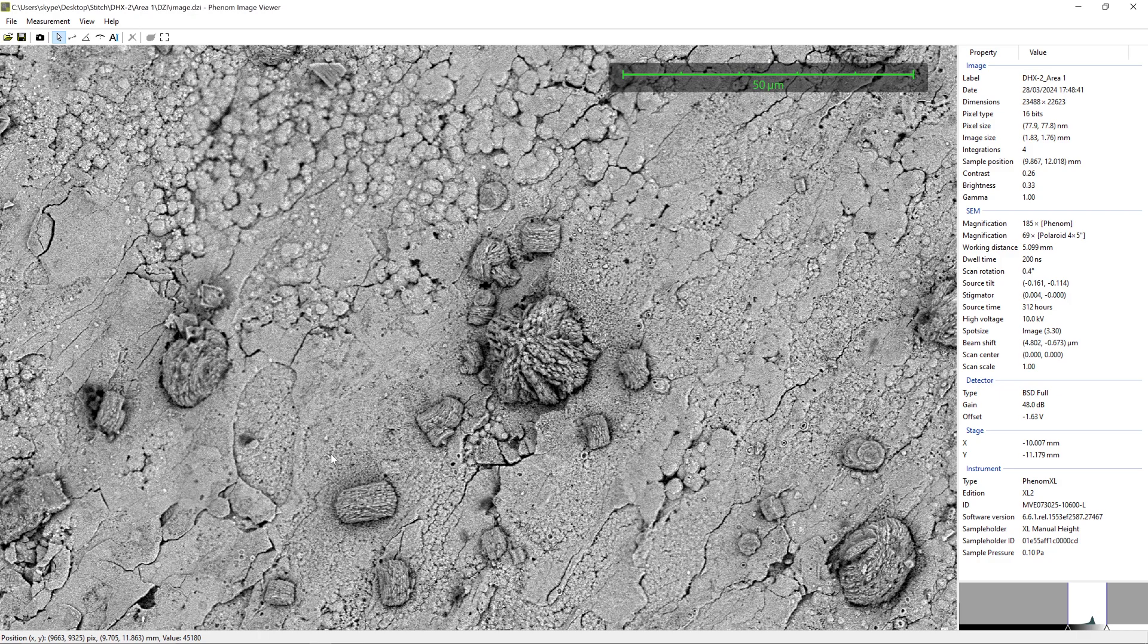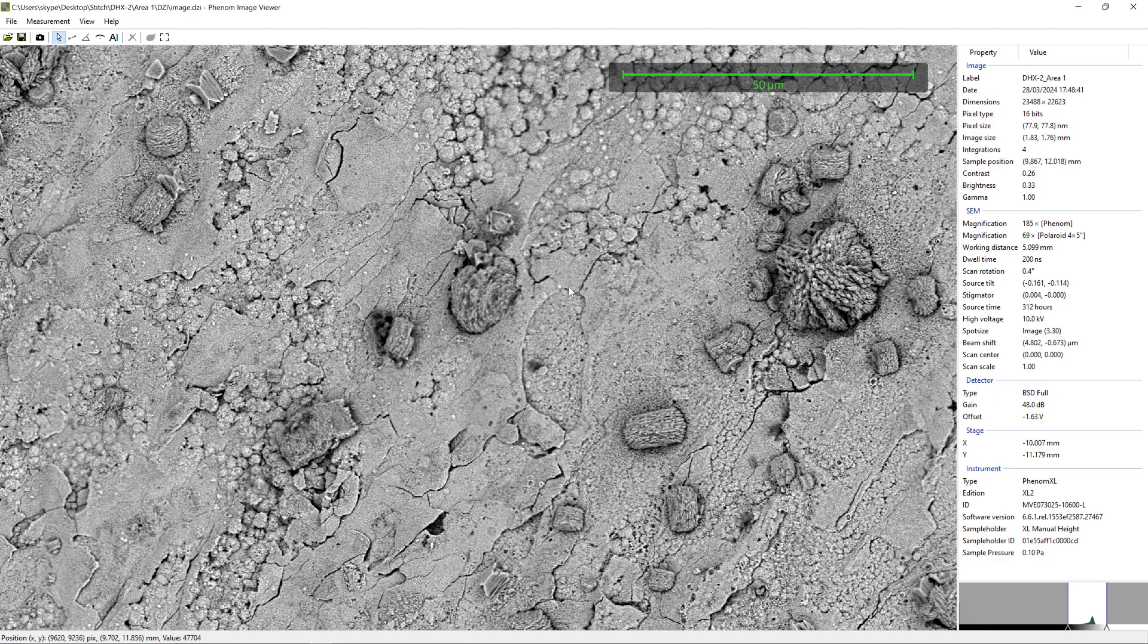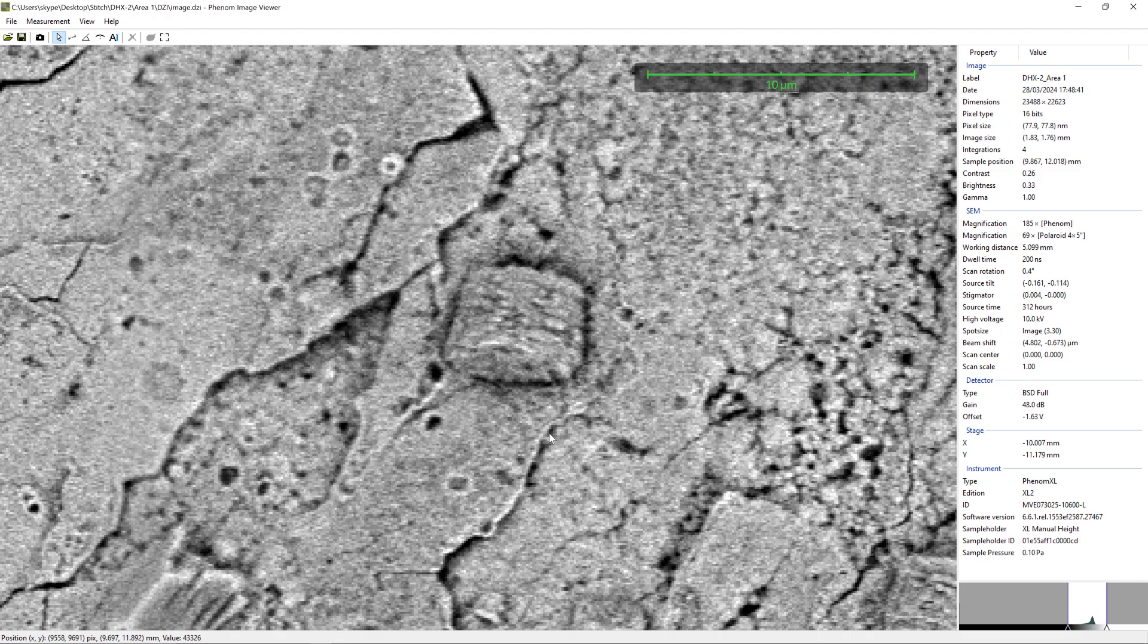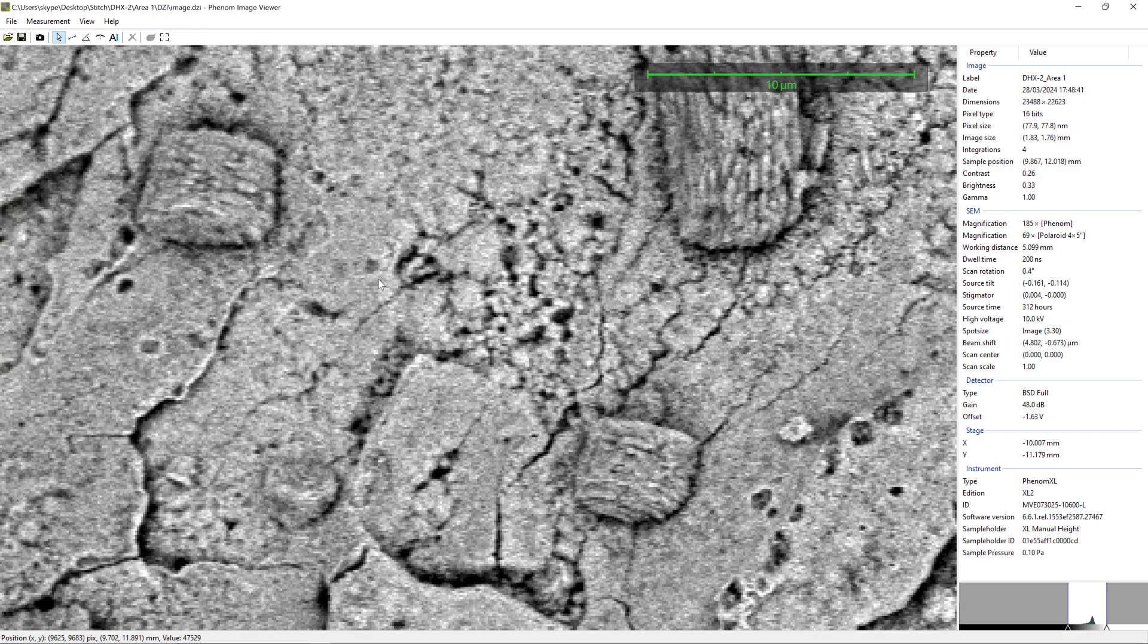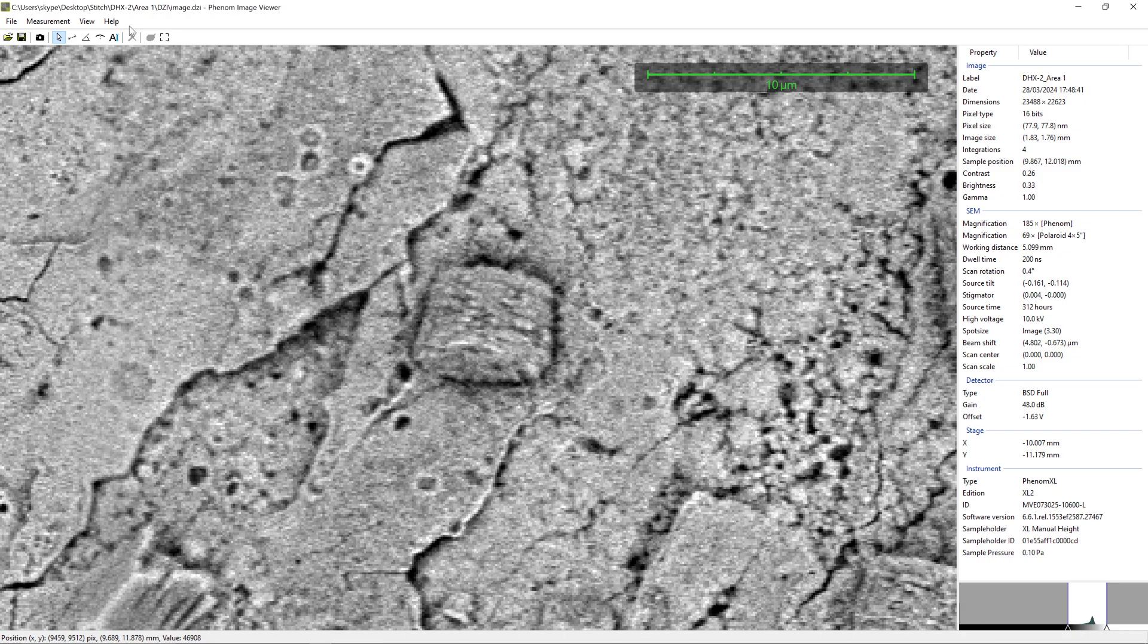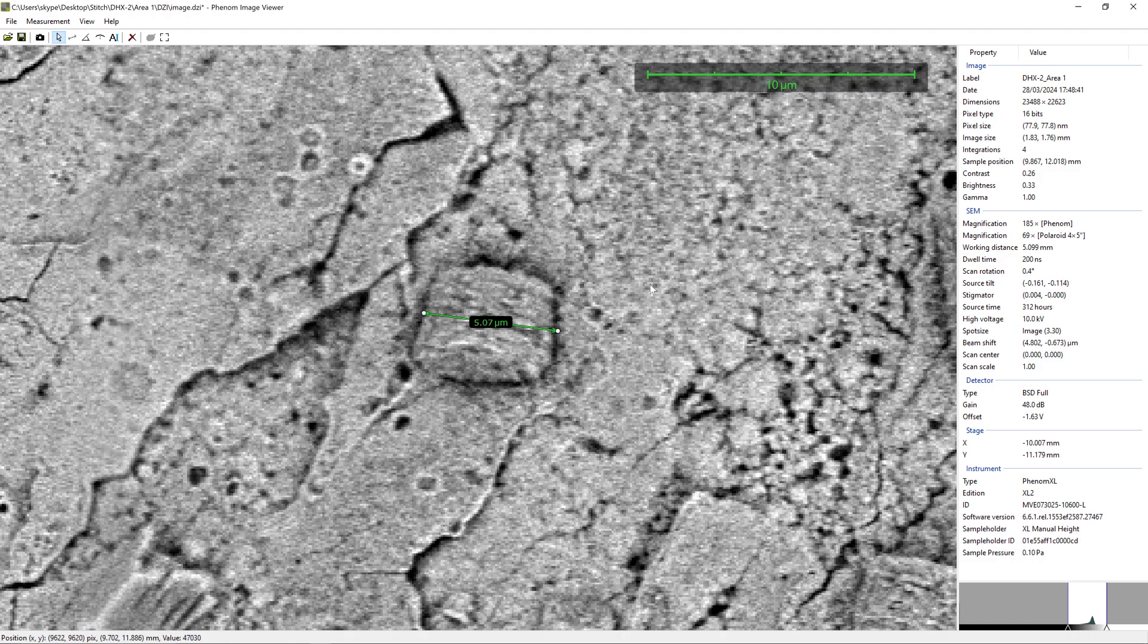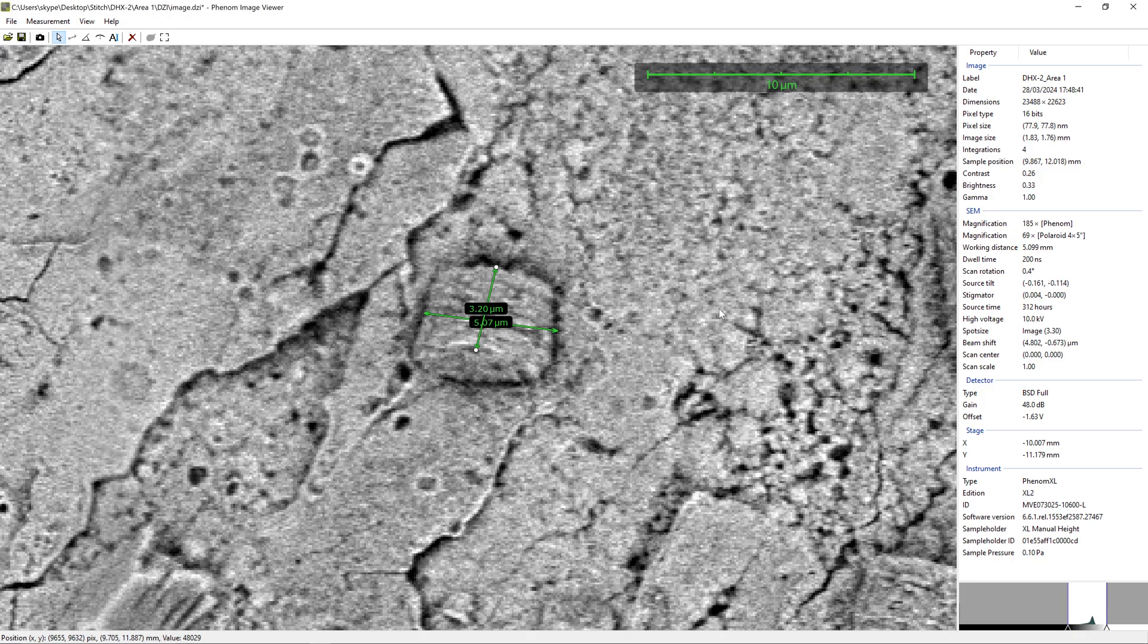Okay, so let's have a look at one of our little Oreos down here. So I'll have a look at this one. We can go across there and measure that. So we can see it's about 5 microns, as Ken Childers would say, across the width. And I guess you can take from here to here - it's more accurate for the height. So it's not square aspect. Of course, it is a cylinder. We can delete those two.